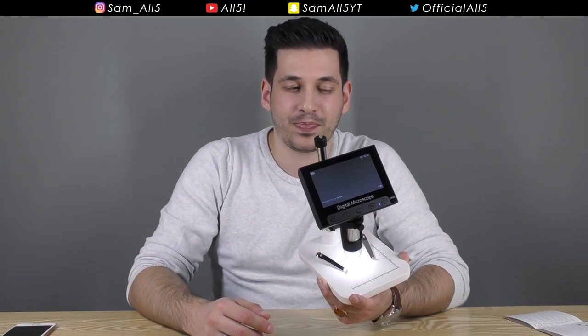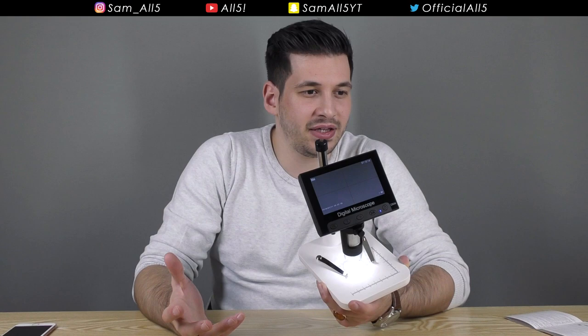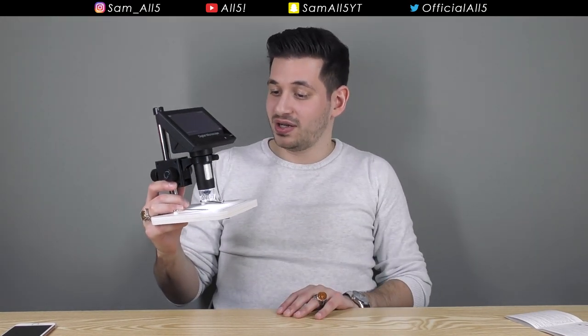Right now I can't even think of what I want to look at under the microscope, but I know tomorrow I'll see some type of material and think 'wow, I really want to know how that looks under the microscope' — and now I can. If you can find one that's a bit better with a better camera that might cost a bit more, go ahead and shop around, but definitely get a digital microscope. Don't be afraid if it's unbranded like this, because this is freaking amazing.